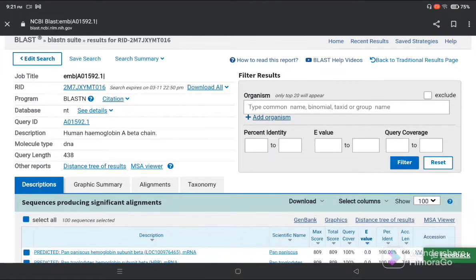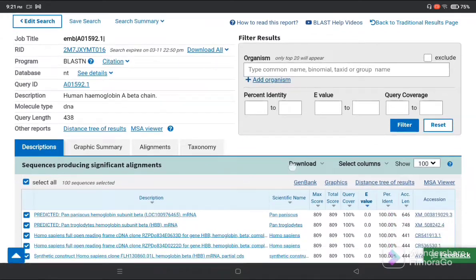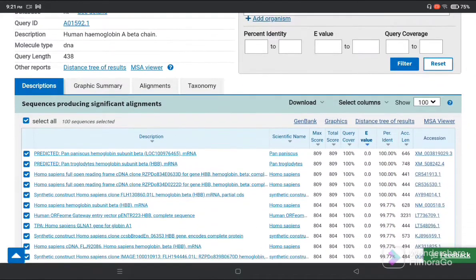It takes more time. Now you can see the results.